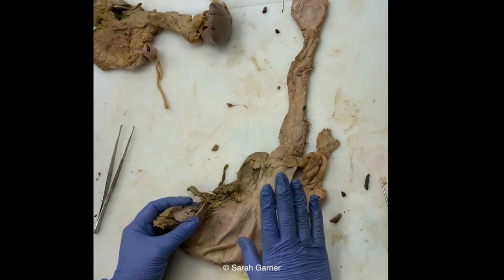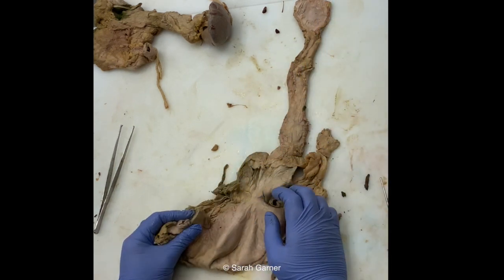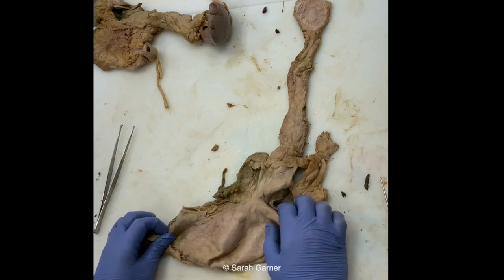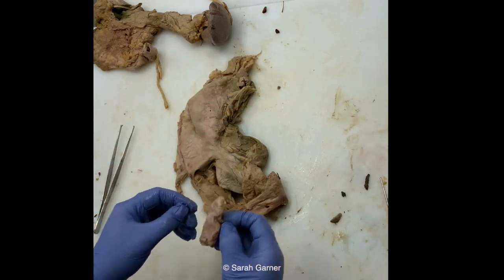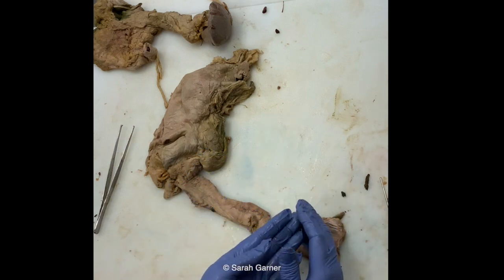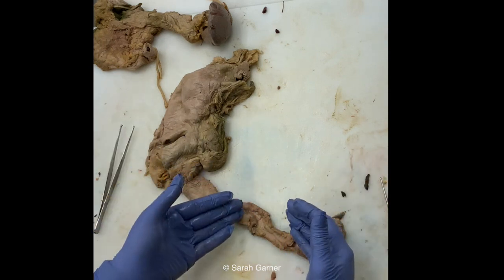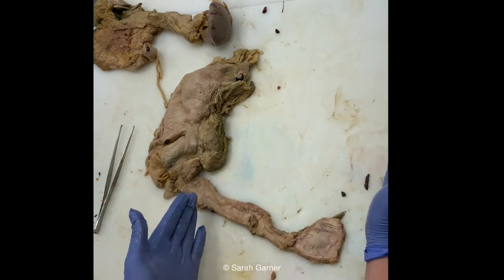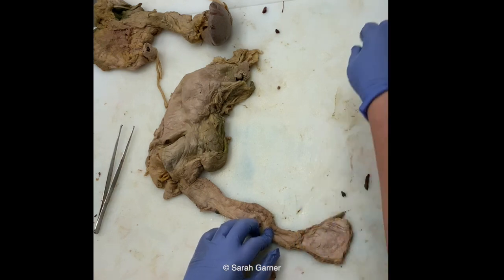Now, if this was an actual autopsy case, I would have clamped that, because they're going to be full and you don't want that going everywhere. So right here, I've cut through the very edge of the pylorus. So that would be clamped, this would be clamped. Now, typically with this, I give the same advice as the gallbladder. You want to do this over a container, because there's going to be a lot of fluid in there and you don't want it to go all over your table, but you also should inspect it and note what it looks like, if there's anything in it, things like that. And you don't want it to just go down the drain either. So this you should also do over a container like we did with the gallbladder.